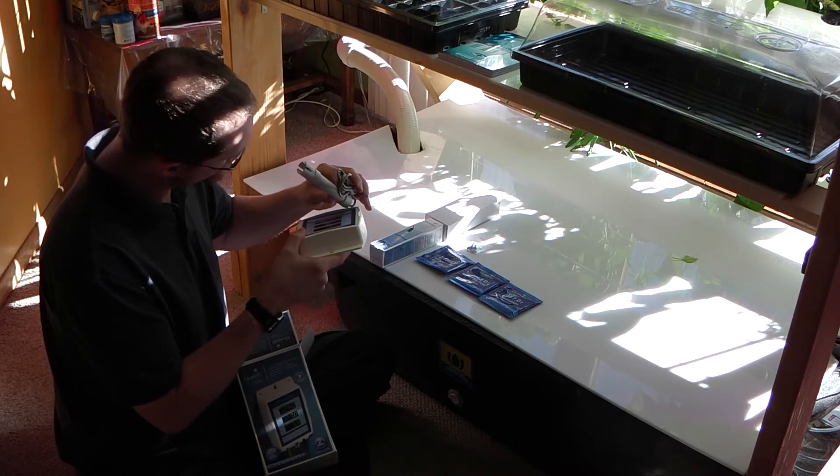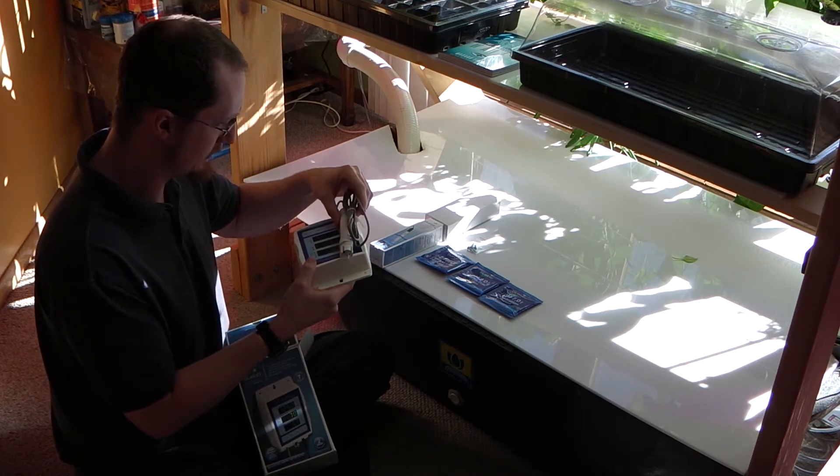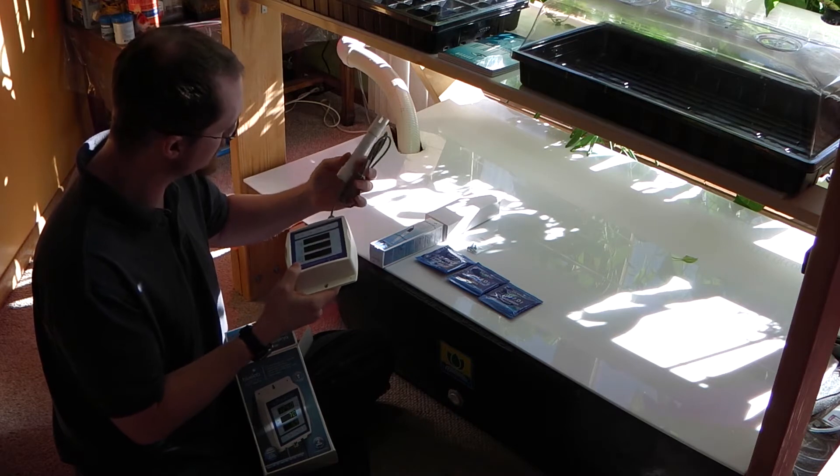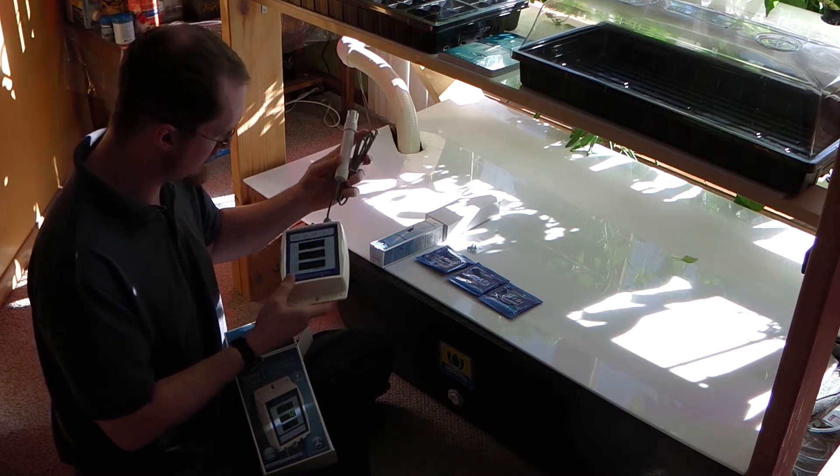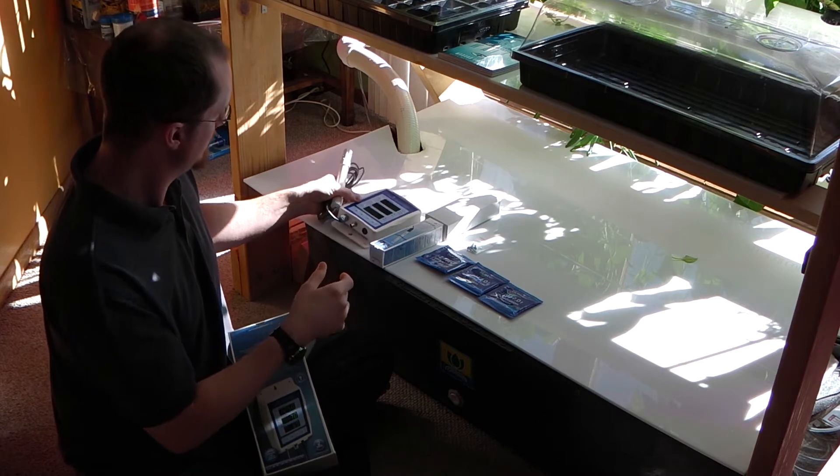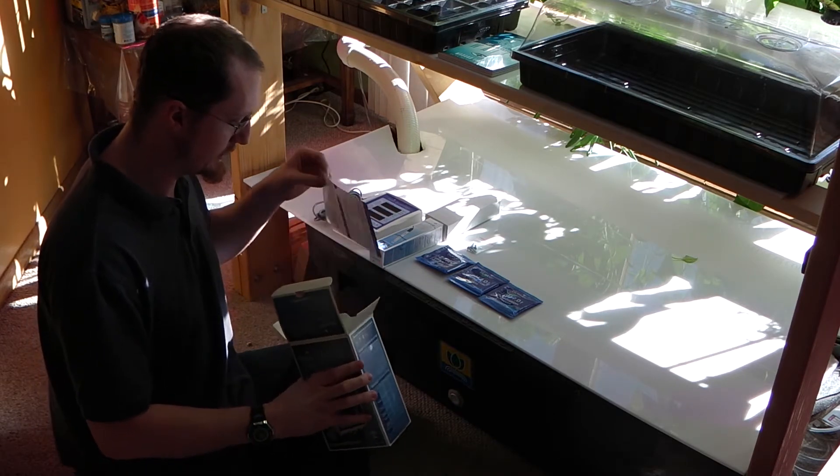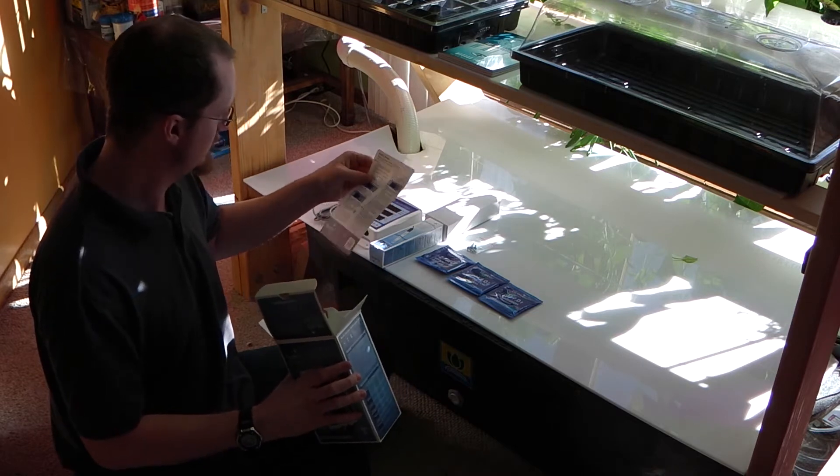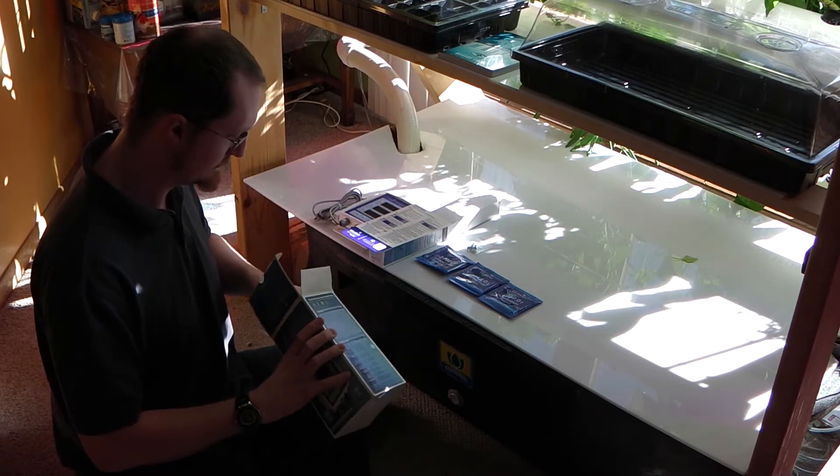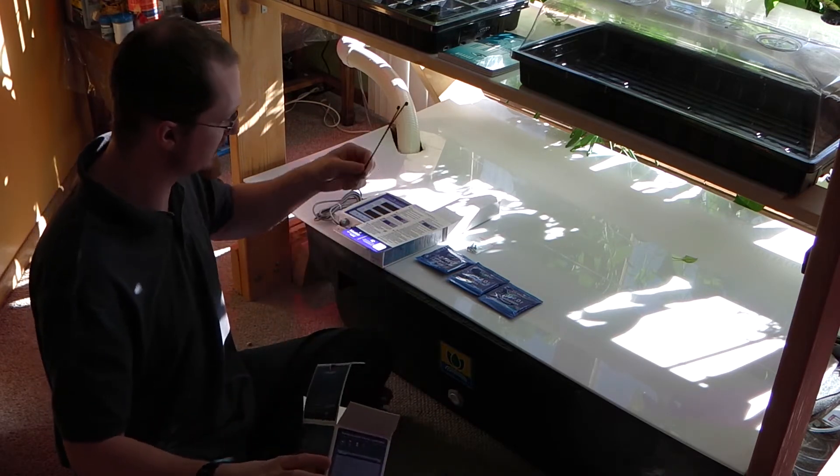That looks like probably the total dissolved solids meter right there already hooked up to it. And last but not least, instructions. Oh, I guess there's some zip ties in here too.